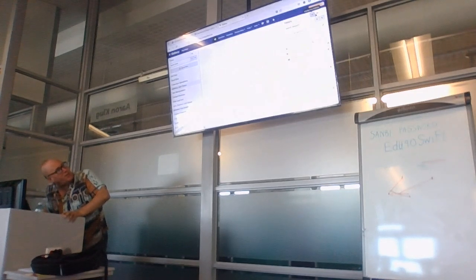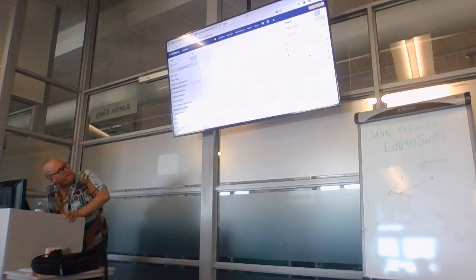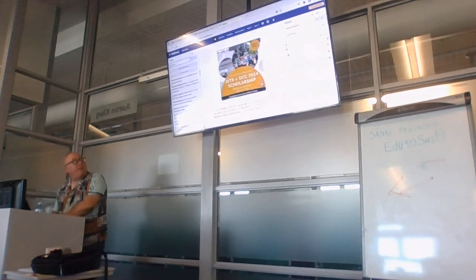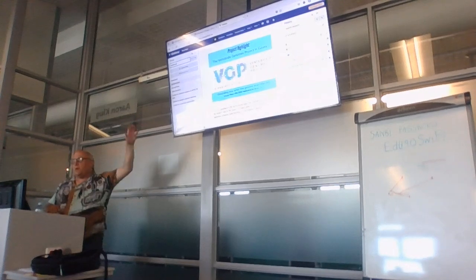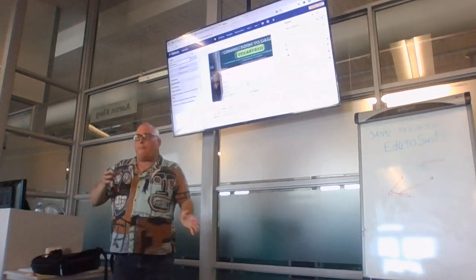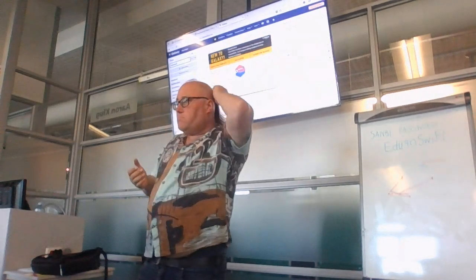Now that's Cameroon's data. Just talk about the dist. Okay, Galaxy is not working today, which is why R was nice. Normally, I can just load my SNP distance matrix here and run the heatmap2 tool in Galaxy and do a heat map there. But today, Galaxy is not playing nicely with me, okay? But use many tools.